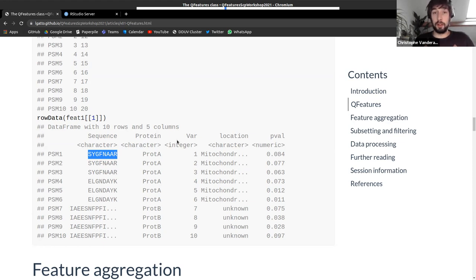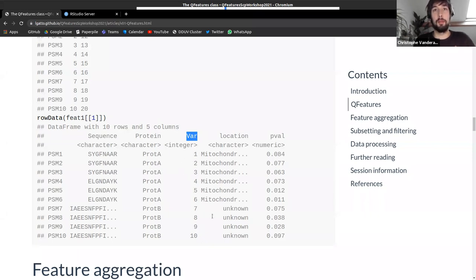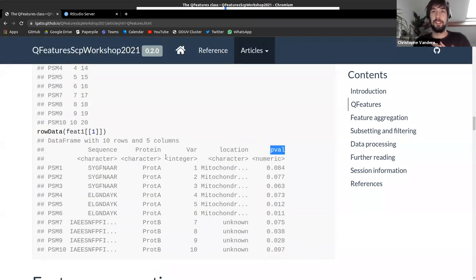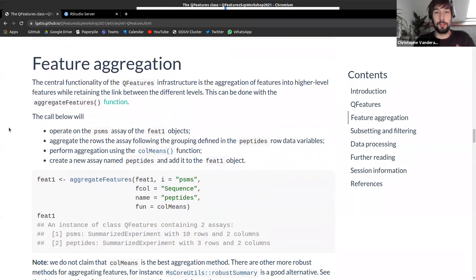The rowData contains PSM-specific variables, shared protein annotation like cell location, and per-PSM p-values representing identification probability. That covers the QFeatures data container in a nutshell. The core function of QFeatures is aggregation, as illustrated with the colored boxes earlier.